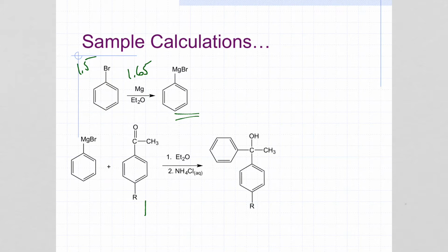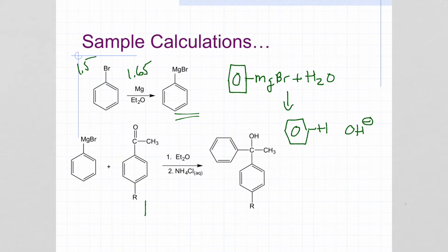The reason for that is the phenylmagnesium bromide, or the Grignard reagent, can react with water to give us benzene, which is one of the side products in this reaction. While we are going to make every effort possible to minimize the amount of water that is present, there is going to be some around, so that's why we make an excess of Grignard reagent in order to react with it, and then we should have enough left over to react with our ketone.